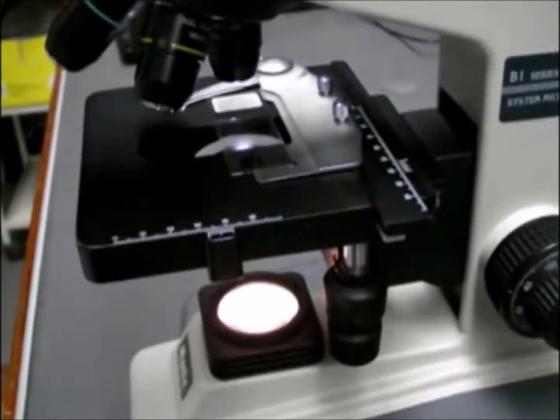This is the microscope stage. This is the specimen on the glass slide placed on the microscope stage. This is the objective lens. Its focusing point is fixed. It is now focusing on this point on the slide.